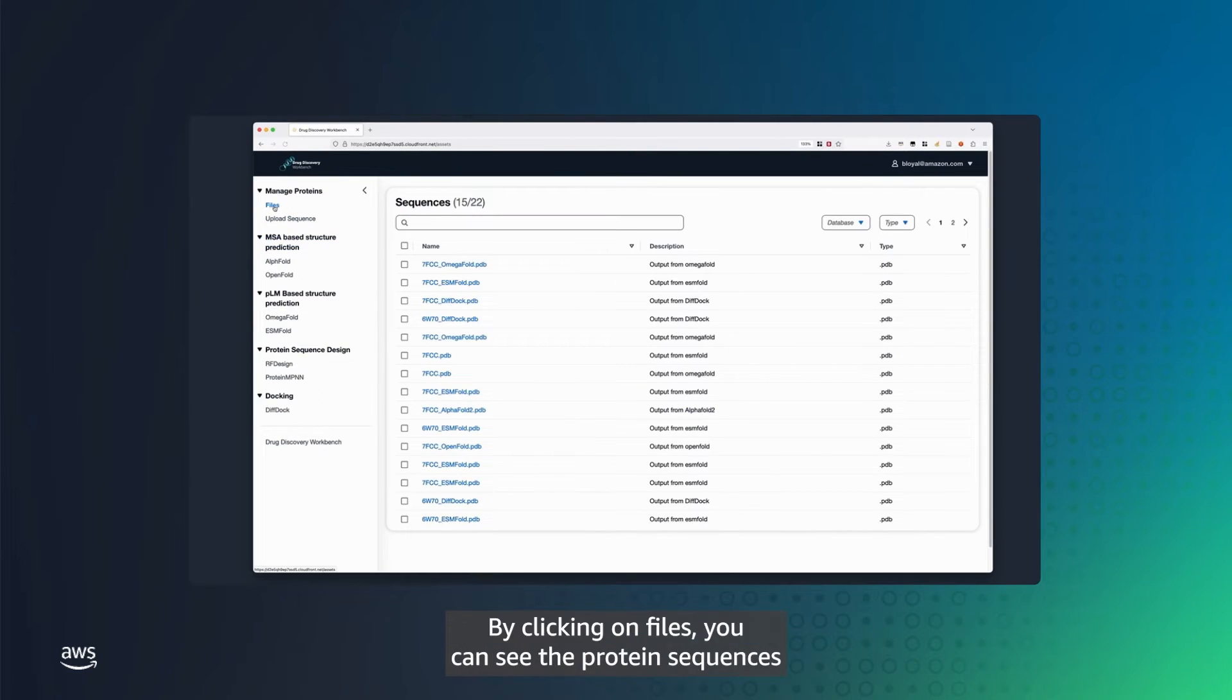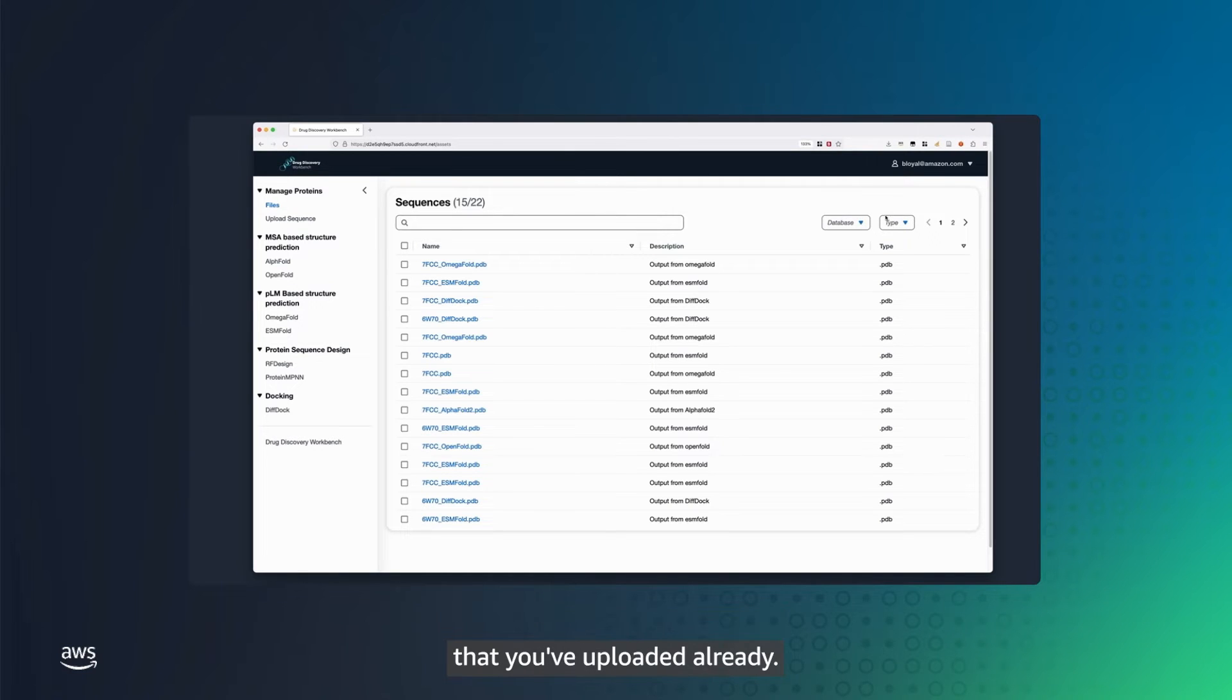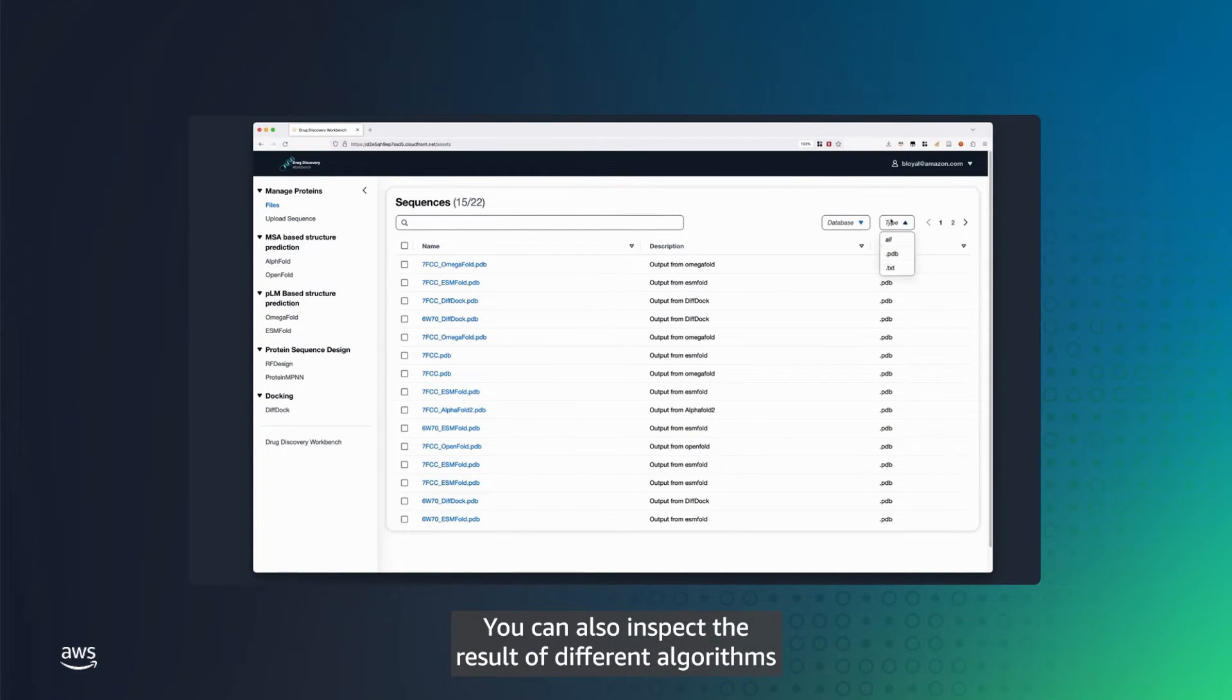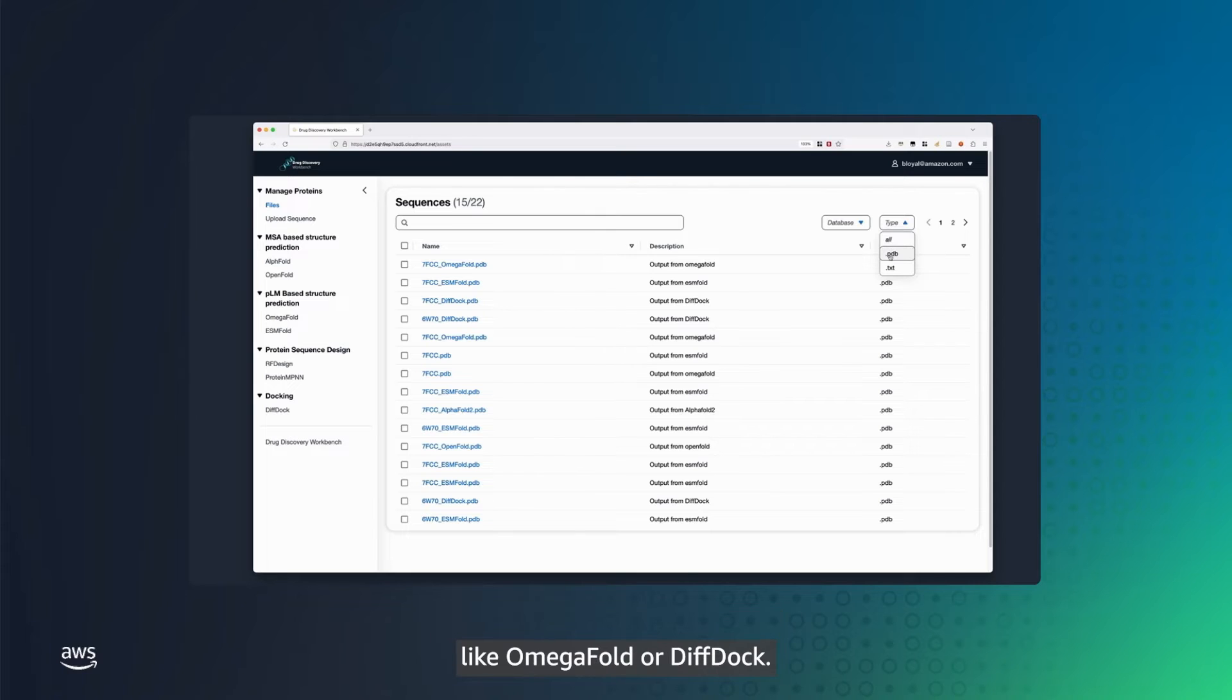By clicking on Files, you can see the protein sequences that you've uploaded already. You can also inspect the result of different algorithms, like OmegaFold or DiffDoc.